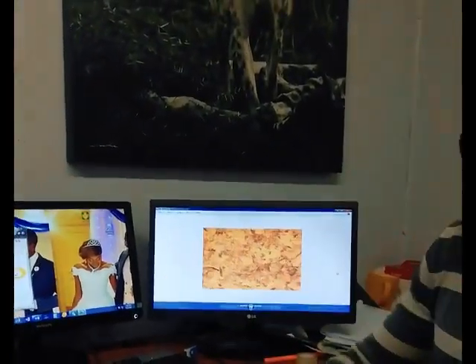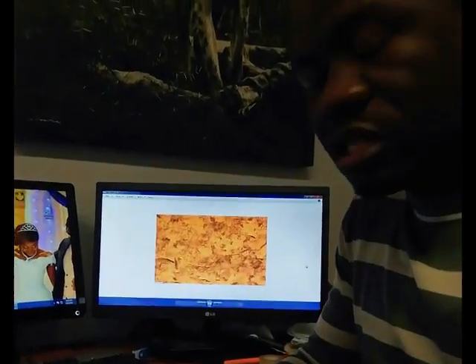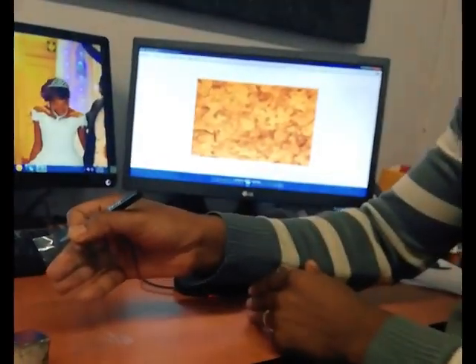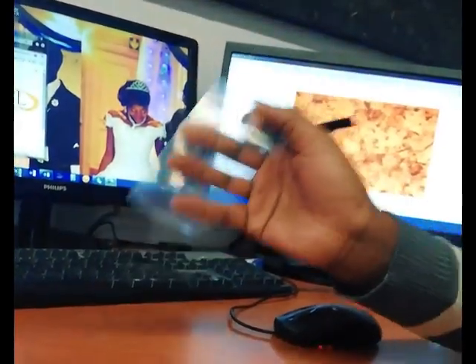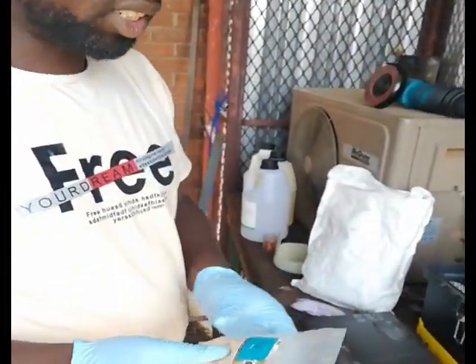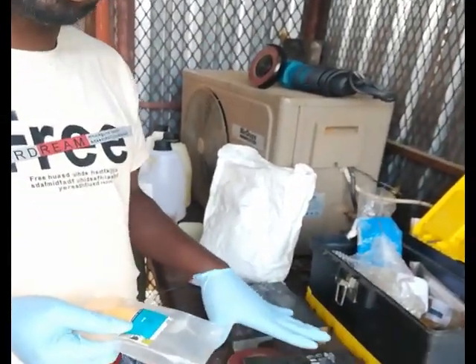Remember, prior to making the print, you need to grind, polish, and etch your samples. Once etched, you do your print and bring it to the lab. This overlay is what you bring for micro structure or replica investigation. Now we are going to witness the sample preparation. This is what we call a replica — it's a micro structure technique where we polish the sample without destroying it.